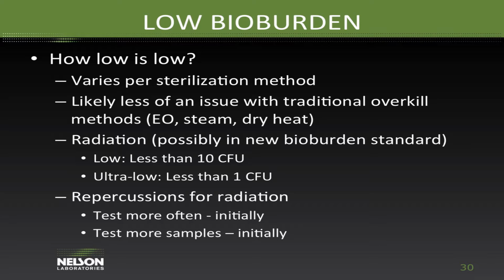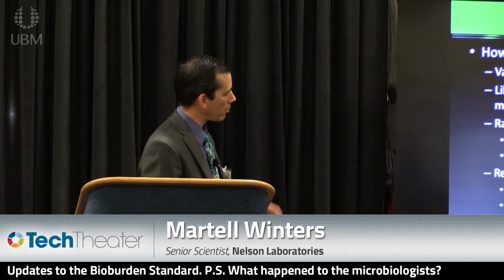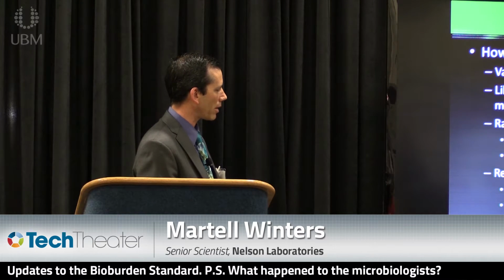Now radiation, we talked about this at the ISO meetings a couple of weeks ago. We'll likely be putting in some guidance there that low might be less than 10 CFU, and a new term of ultra low would be less than 1 CFU. There are some rationales behind that based on the radiation sterilization science that I won't get into, but that might come out. We talked about that as an option.